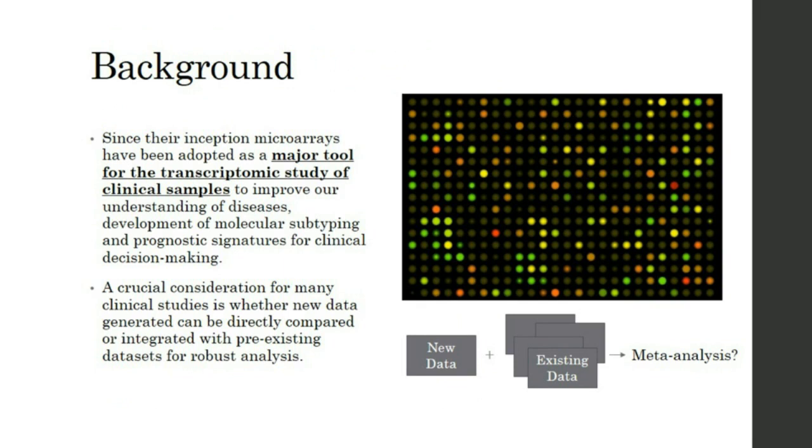So first of all, a little bit of background. We know that since their inception, microarrays have been adopted as a major tool for transcriptomic study of clinical samples. We've been using them for years ourselves. And this has really helped us to understand how disease develops, how we can start to molecularly subtype and derive prognostic signatures from different clinical samples, which can really have an input in translational research.